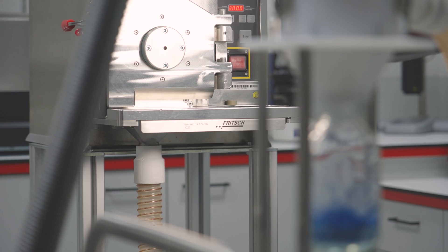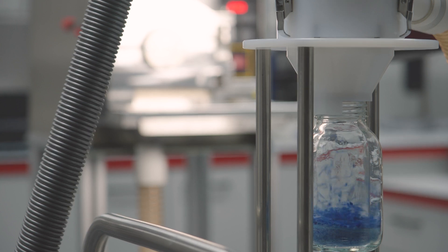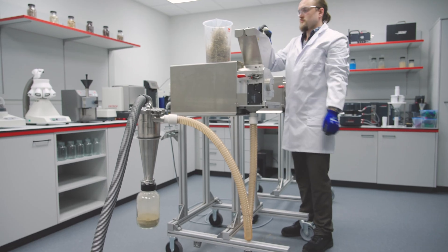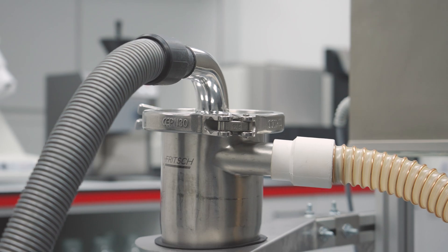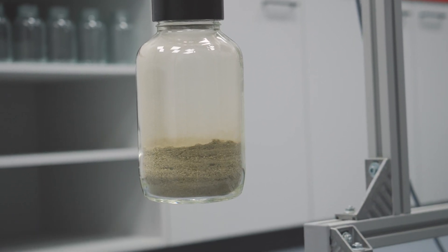Even greater flexibility comes with Fritsch Cyclones, enabling fast, clean and cool grinding with increased throughput and finer results, ideal for particularly difficult samples.